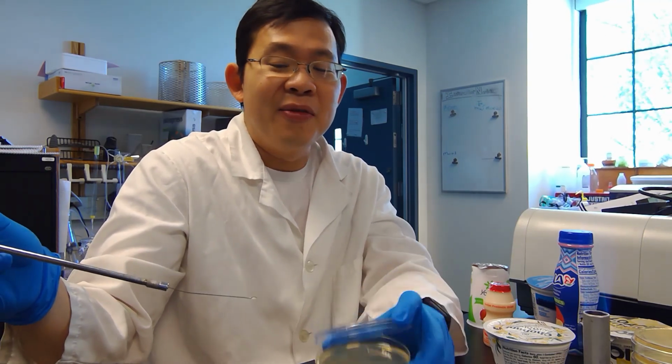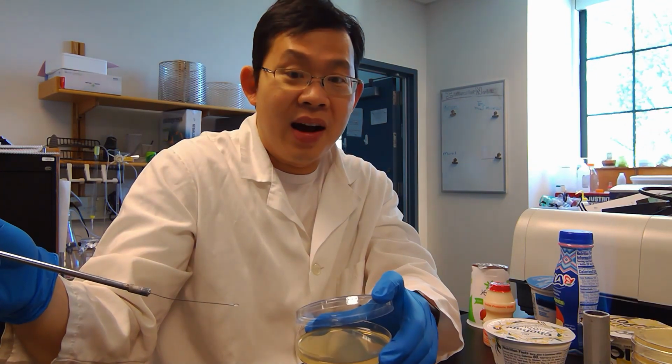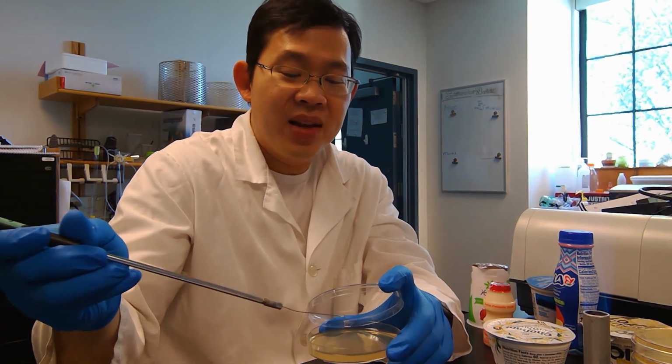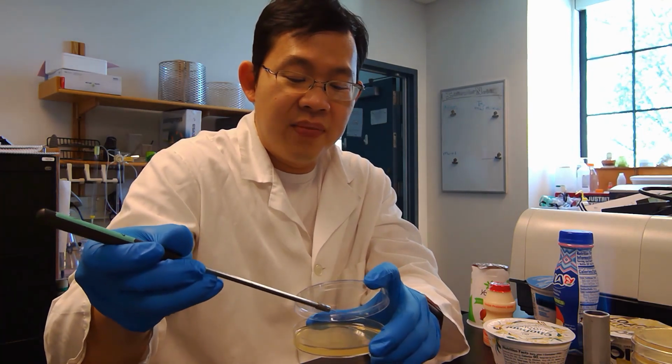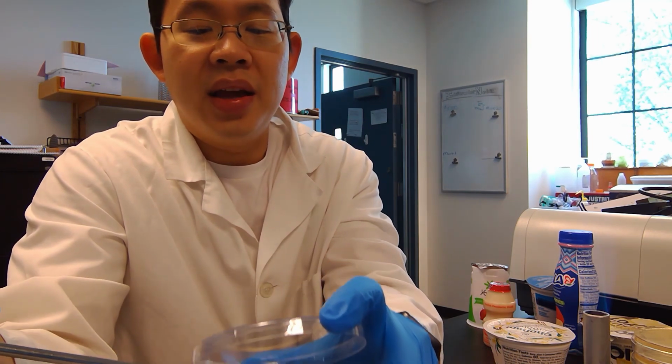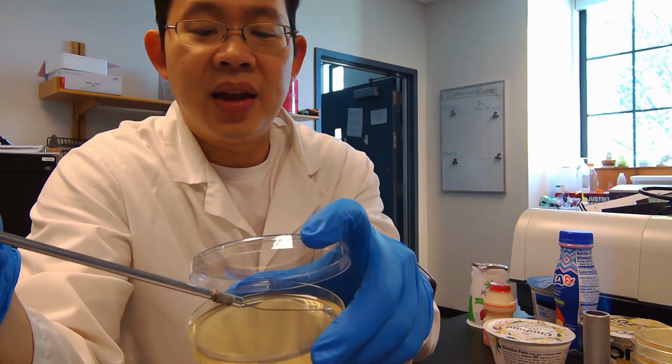This is why we want to protect our agar by opening it with the clamshell method. Okay, so here I'm going to spread the sample in the first quadrant here. Okay.